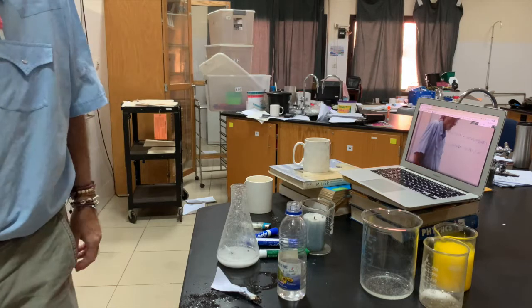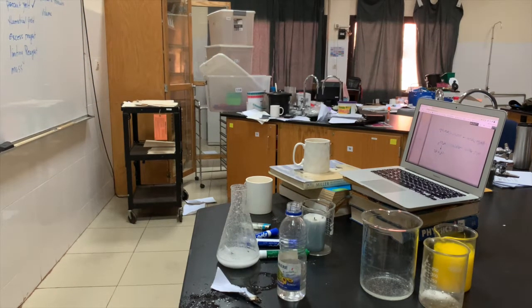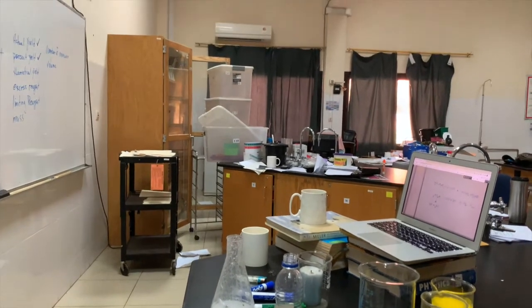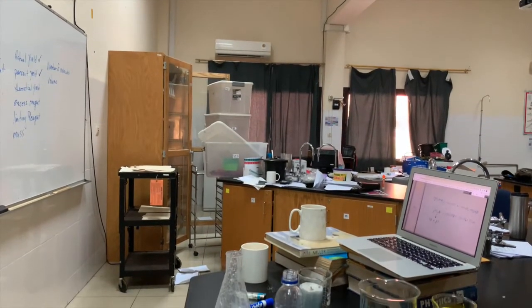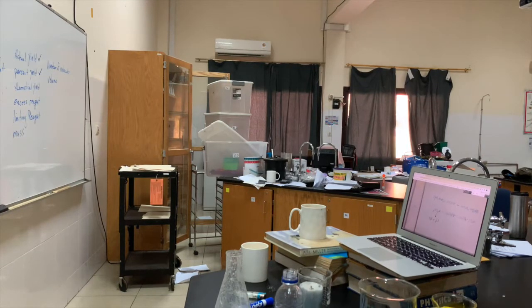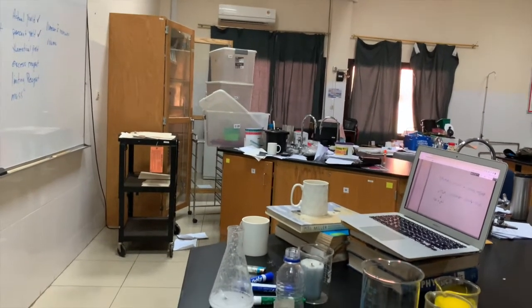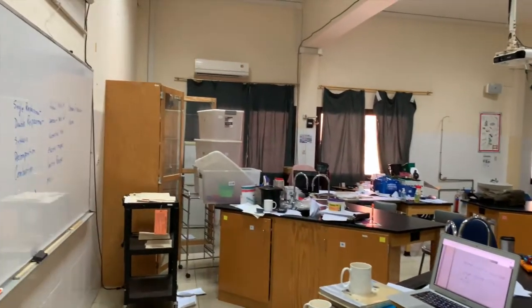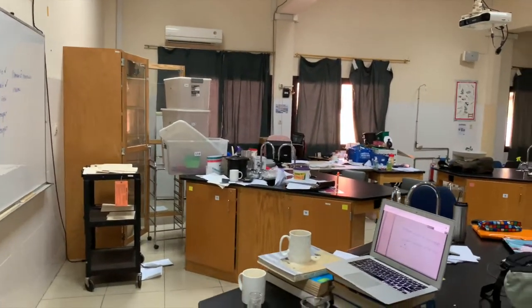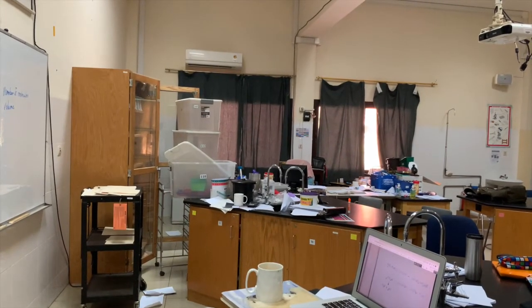So, what we did was, get those books. Where are those books? And can we drink the yellow thing? It's lead. It's not drinkable. You don't want to drink anything with lead in it. No, don't do that, because I want the lead to settle. The lead iodide, I want it to settle.